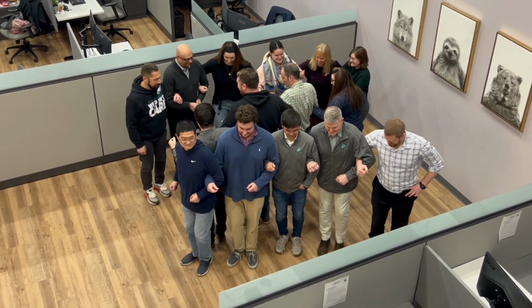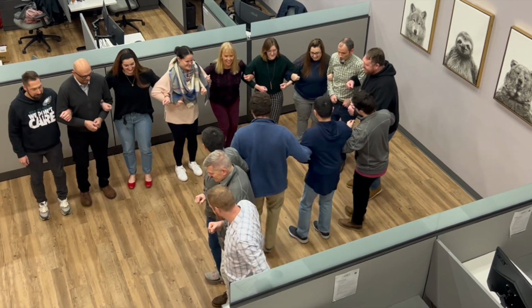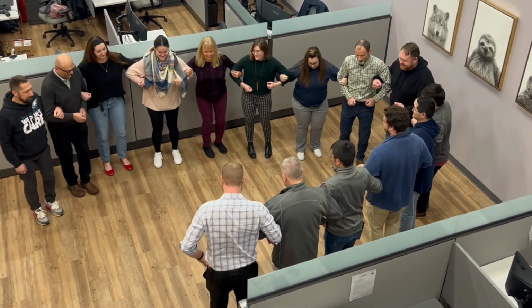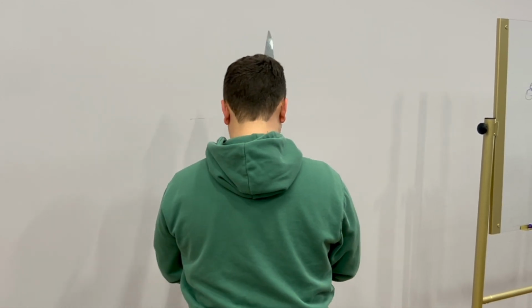First, we need to unfold the protein from its native state. This is called denaturing and is commonly accomplished by changing the pH conditions of the solution the protein sample resides in. The protein is now ready for the next step. The digestion step breaks the denatured protein down into smaller chains of amino acids called peptides.